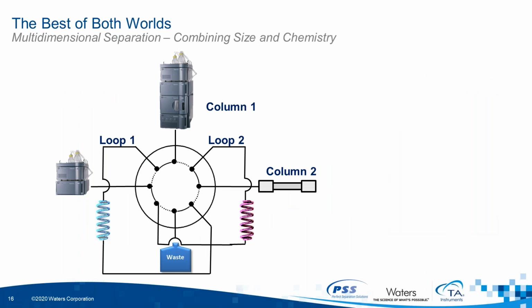So how will this setup now become a solution for a comprehensive 2D, and how can we create such a nice contour plot Jenny has already shown and Claudia will explain more later? First of all, it's important to understand what comprehensive means. In comprehensive 2D LC, the sample containing effluent of the first dimension is fully sampled, which means we won't ignore any sample parts. We'll just re-inject everything. The definition of comprehensive requests also that at least equal aliquots of all fractions are transferred from the first to the second dimension.